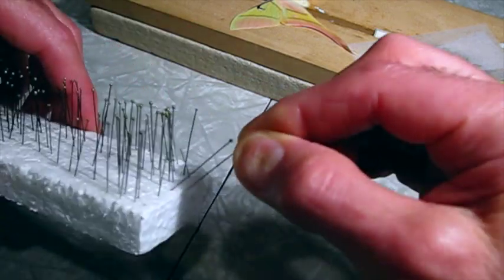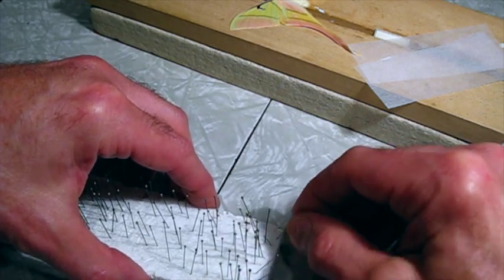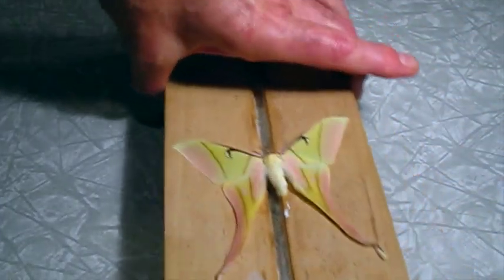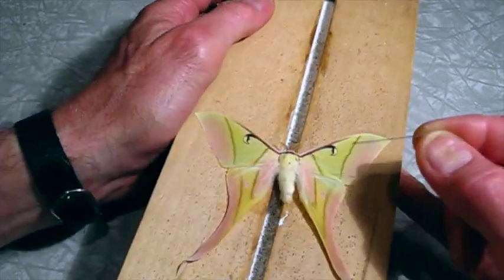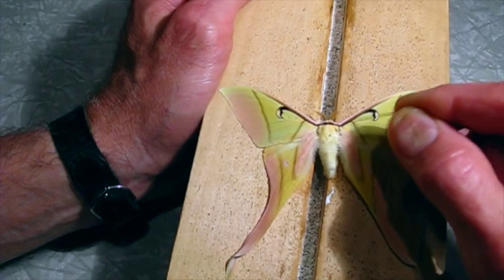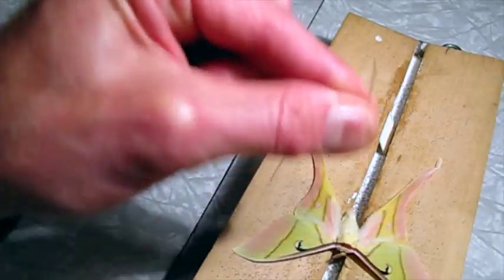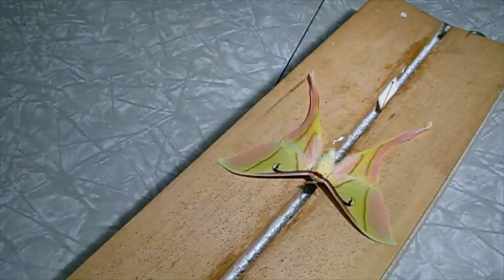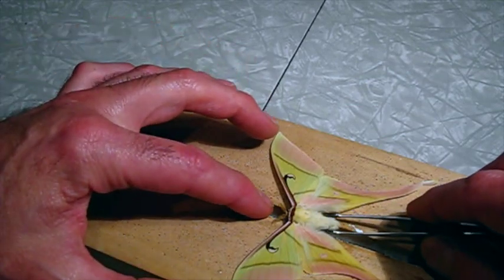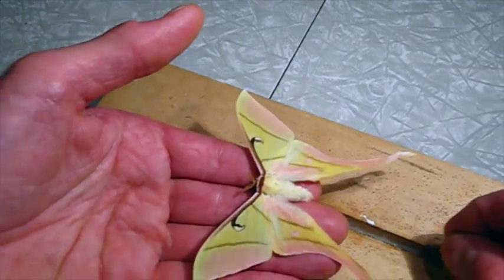I'm going to make sure I get a size three pin — I only have threes and ones. That's going to be the center pin. I can see where this moth was pinned before — it's a bit low on the thorax. I want to go right through the center; I always find that centering gives the best results. I want the pin straight up and down and I want it straight through the middle as possible. I think I might set this on my hand — that'll give me more control.